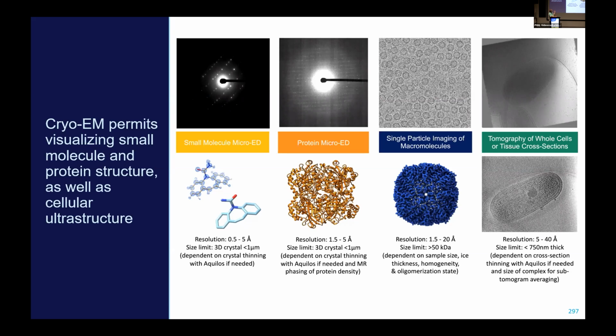For individual protein structure determination, our Krios cryo-TEM plays a front role. We can either do microelectron diffraction of protein crystals, or if you have purified proteins, you can do single particle analysis in order to get atomic resolution without needing to do crystallization. But the Krios also has 2 other workflows that we're pulling in to the 1,000 Fungal Proteins project.